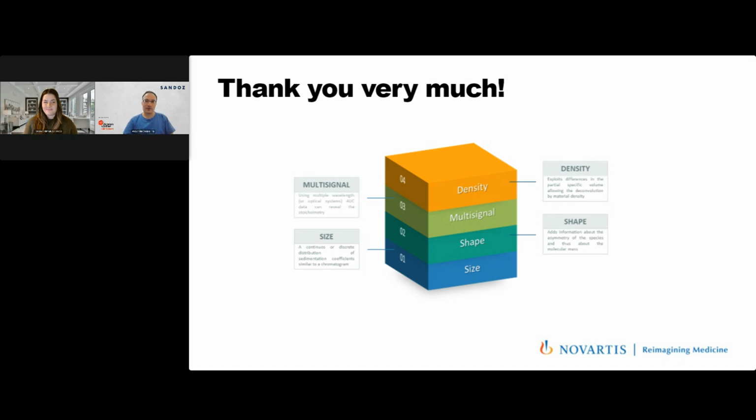Oh, a deadly question. No, I wouldn't go that far. At least in my lab, I also encourage new colleagues to really get familiar with all the software packages which are available. I know there is contention and dispute going on, but I do not really take a stand on that. For data management and having an overview, and controlling your instrument, it's a base, but nevertheless, SEDFIT and Gussi, and also, which we haven't mentioned today, Walter Stafford's Sedanal, have their individual strengths for certain systems. For example, Sedanal has a really cool model editor. So no, I wouldn't say any software will fully replace the others. They all have their value.